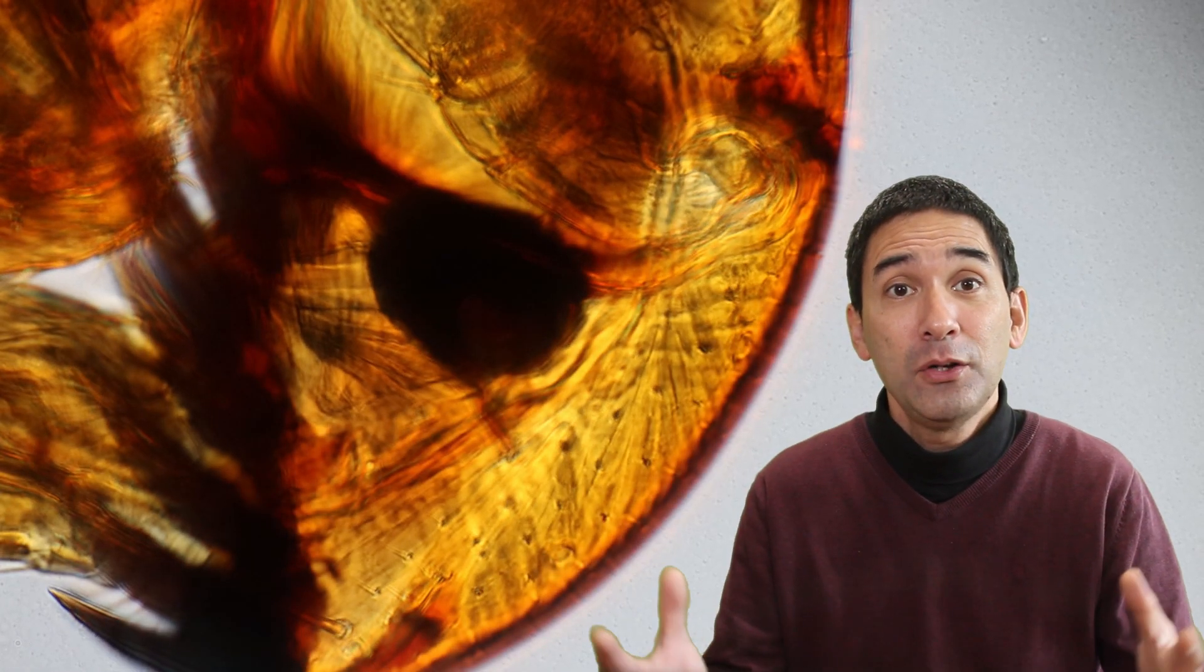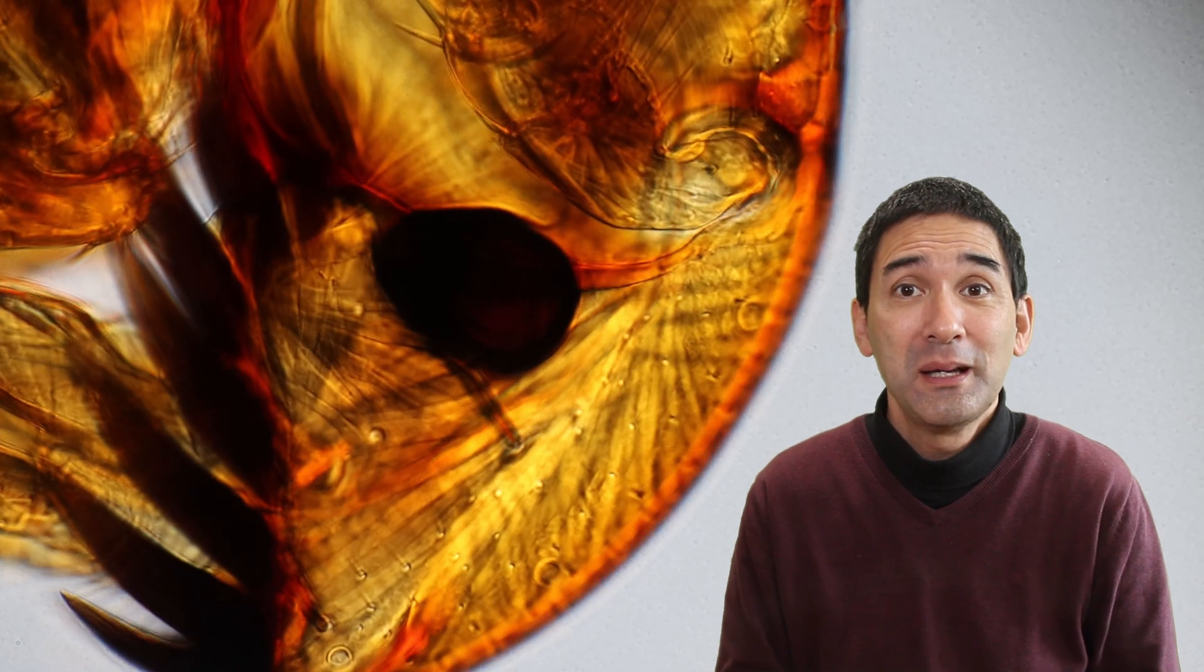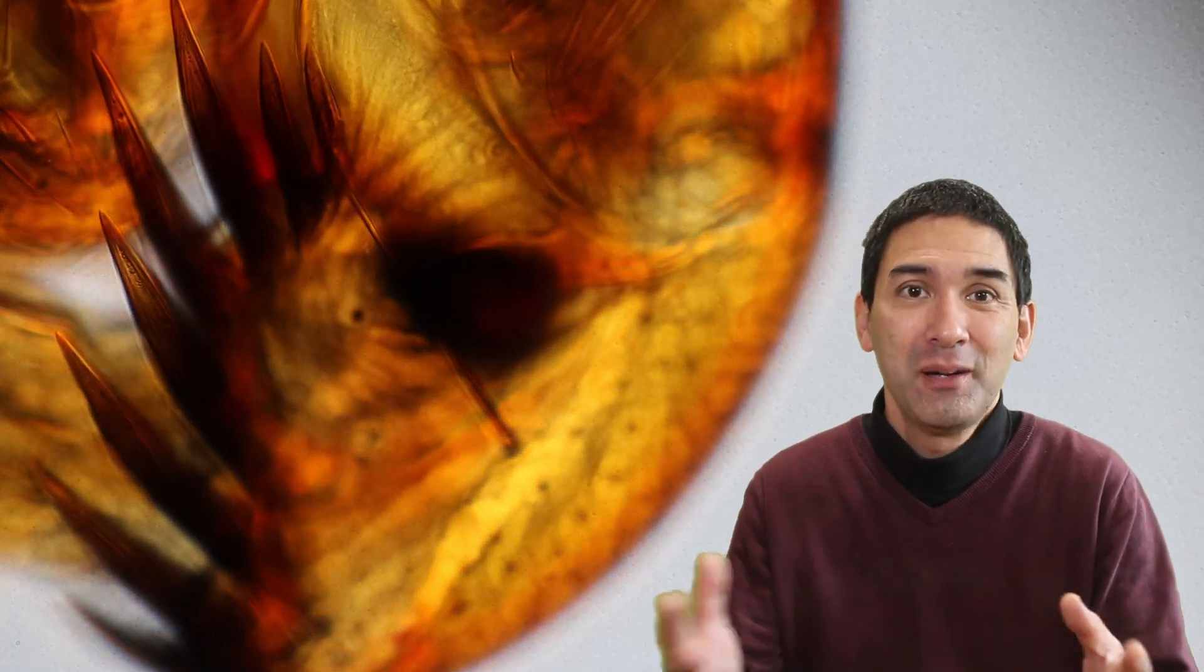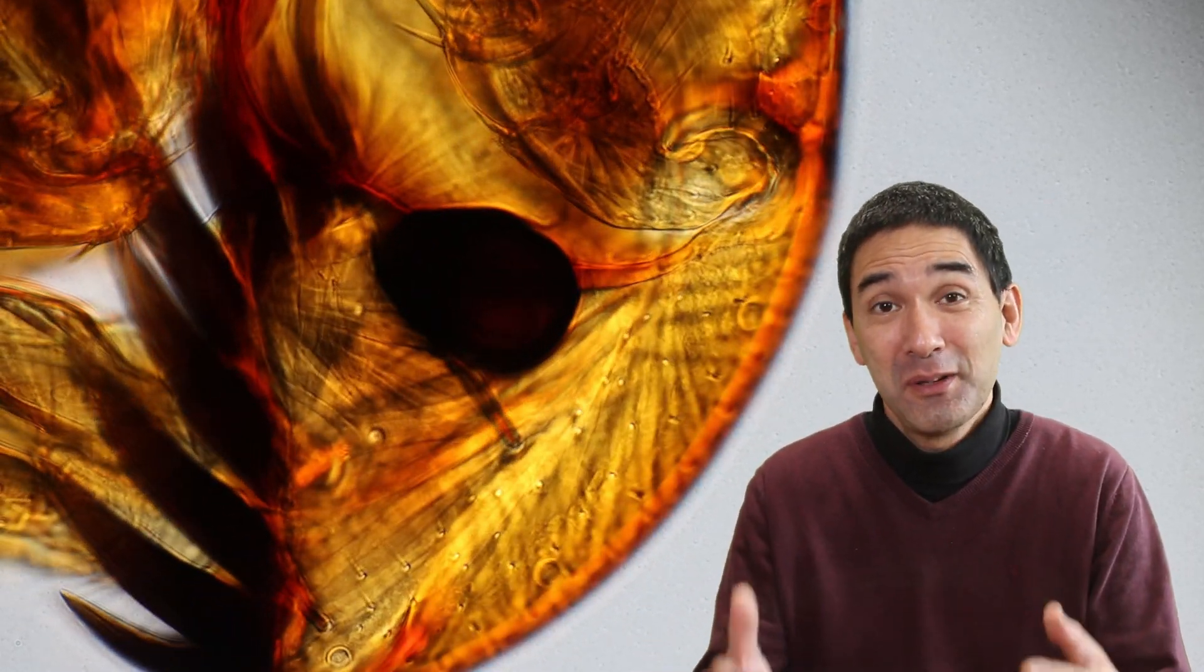Now fleas might be quite strong, they might have strong muscles, but they do have one disadvantage. I'm talking about the muscles here. The muscles are quite slow. The muscles cannot contract quickly enough to make the flea jump that distance.